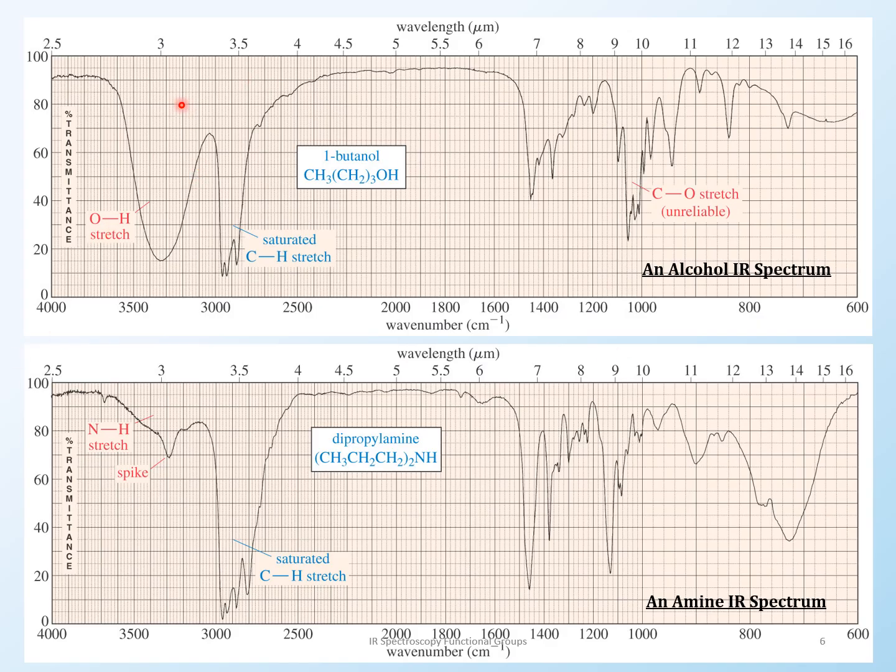Okay, so here's an alcohol peak, right? You can't miss that. It's just right there in your face telling you, look, I'm alcohol, I'm alcohol. So it's huge, okay? And everything else here, you can ignore. I'm telling you, no fingerprint region, okay? Just stay away from it. I know the labels are there, but just don't look at it. So focus on this region, which is the CH, OH, and NH region, the triple bond, the double bond region, okay? So here is the OH, very, very clear. Now whether you have a primary, secondary, or tertiary alcohol, it will give you the peak no matter what.